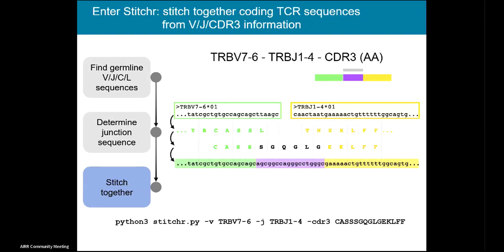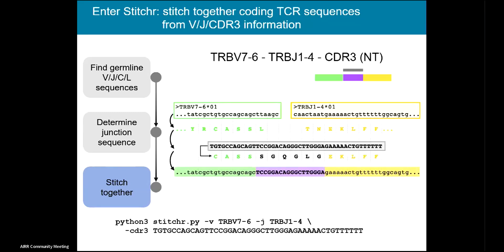As you can see, the terminal command used to achieve this is very straightforward — you're basically just telling Stitcher the properties of the TCR that you want. Because this central section is essentially codon-optimized, you're probably not going to make the exact nucleotide sequence found in the original recombination, but it will translate to the same amino acid, which for functional studies is often what we care about. You can also provide the CDR3 as a nucleotide sequence. It's basically going to do the same thing, except it's first going to translate that nucleotide sequence into the amino acid and then repeat the process.